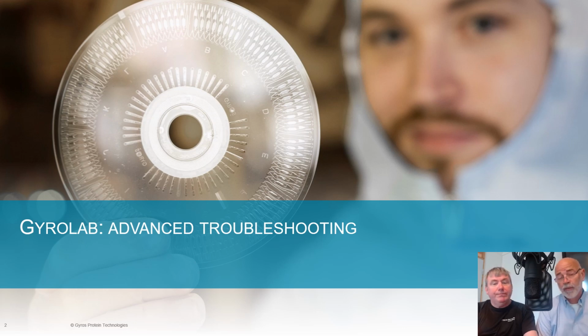Yeah, and I think one thing to keep in mind for those who have been using a plate-based system for years and are transitioning to the gyro system, there are some additional considerations, and we'll talk a bit about those and some ways of thinking about troubleshooting that might be slightly different than what you've been used to.